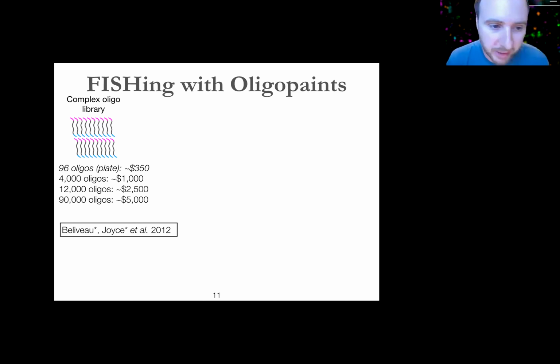Now the practical things to know if you're thinking about maybe using this technology and you haven't used it before, in terms of what it costs to get set up with one of these libraries. It depends a little bit on the scale and the complexity. This slide is actually a little bit out of date. If you want a lot of material for each individual oligo, you would typically order individual column synthesis products from IDT in plate format. Similar to ordering tubes of primers, here you're getting on the order of nanomoles per sequence. It's a lot of material, but you're paying a lot more because of it, and this doesn't scale well beyond a couple hundred oligos.